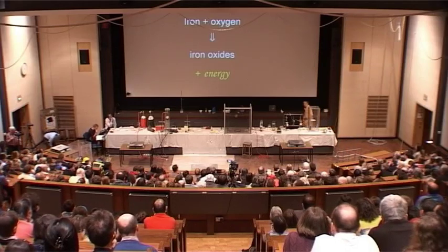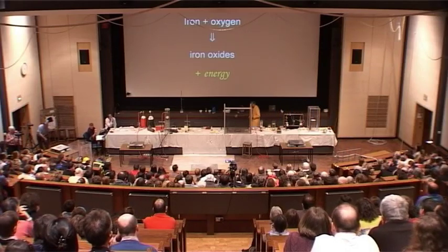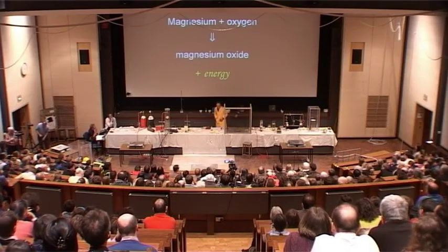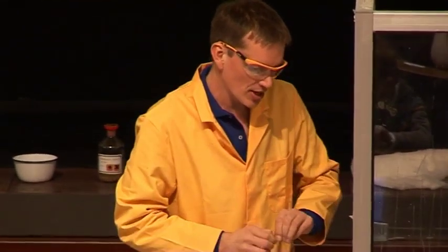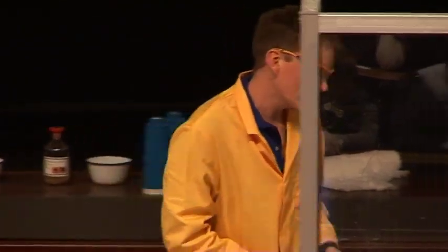Some other metals are even more reactive than the iron that we saw, and one of these is magnesium. Magnesium is just a silvery metal — this is in the form of magnesium ribbon here — and this burns in air very easily.